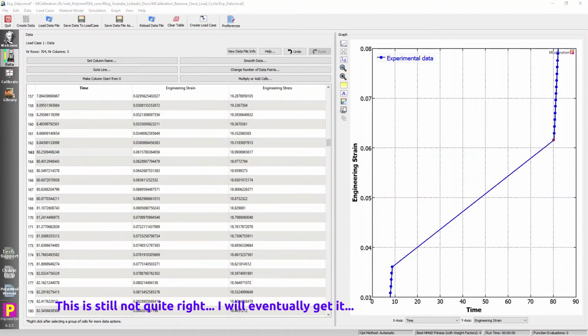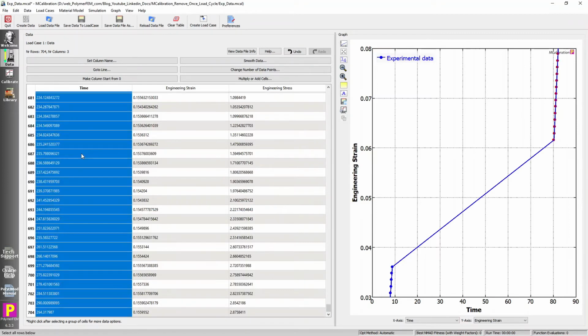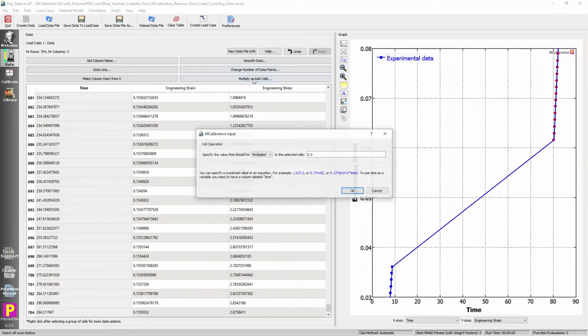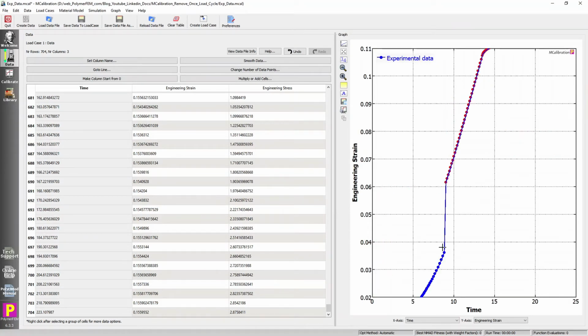So I believe what I should do is click on this data point again. I'm going to go Control Shift down. I'm going to add and subtract, and I'm going to do add. I want to add minus 71.21. And that should bring it over here. Now we actually have brought it a little bit too far. It goes up too rapidly. It should continue with this slope here.